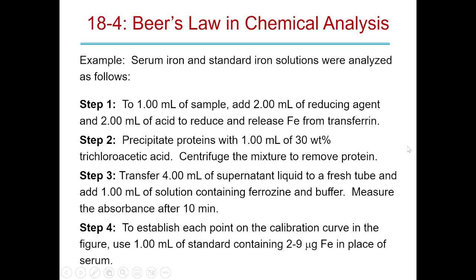So if you do your standards, this will tell you where your limits of detection are. It will also tell you where you end your linear region and where you end your dynamic region. Because you know this concentration, you can test this, right? Your unknown, you don't know. You don't know if it should have been here, here, here, wherever. This, you know the next point needs to be up here, the next one needs to be up here.